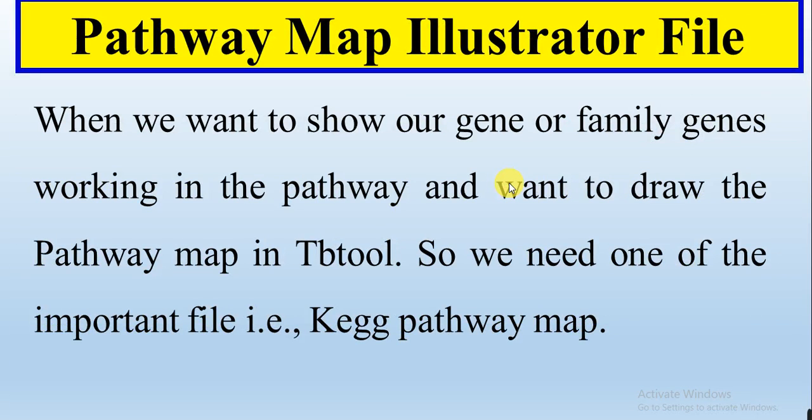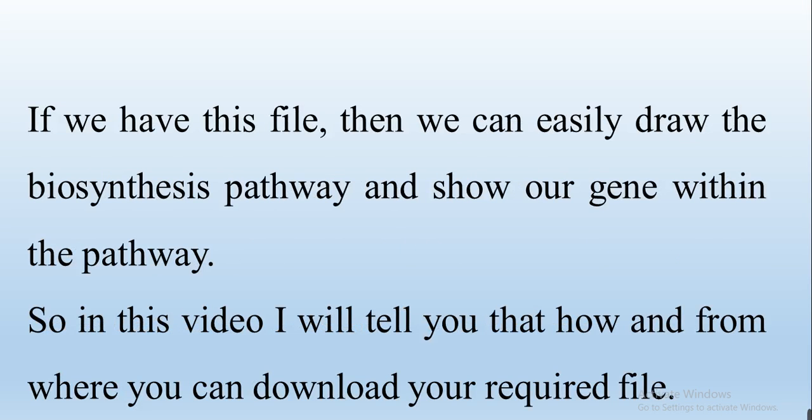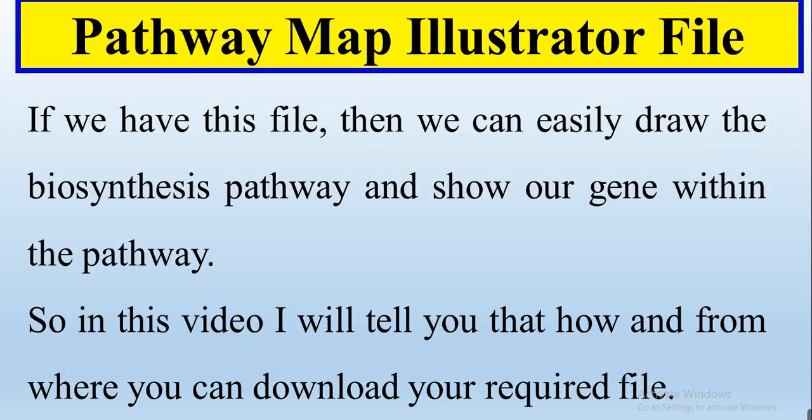In this video, I will tell you how we can download the pathway map illustrator file, because when we want to show our genes or gene family working in a pathway, or want to draw the pathway map in tbtool, we need one of the most important files, that is the KEGG pathway map illustrator file. If we have this file, then we can easily draw the biosynthesis pathway and show our genes within the pathway.